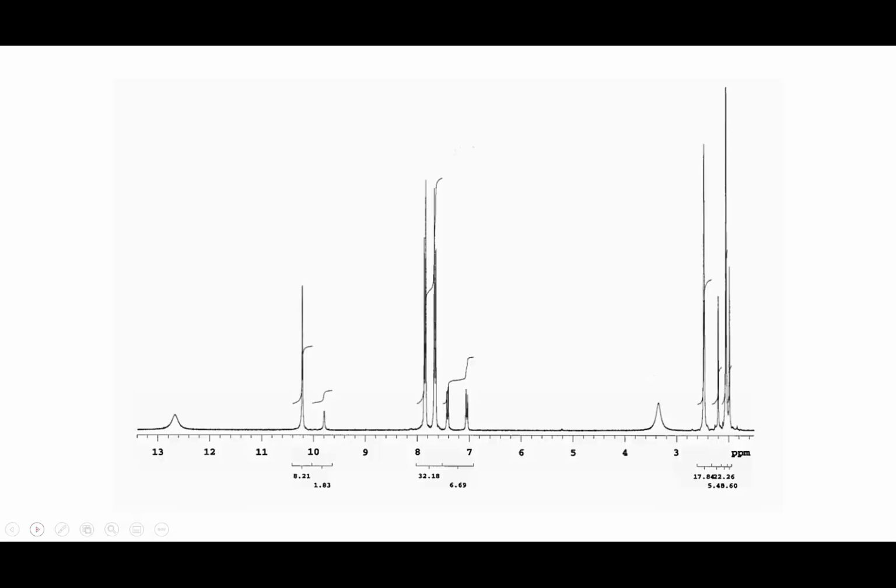So here is the spectrum, and this is a pretty typical one for product B. Let me again write its structure out. But now we've oxidized the methyl group to a carboxylic acid. This sample also has a tendency to be wet because the carboxylic acid group hydrogen bonds really well with water. Even though this has been air drying for 3 or 4 weeks, there's still a little bit of water.